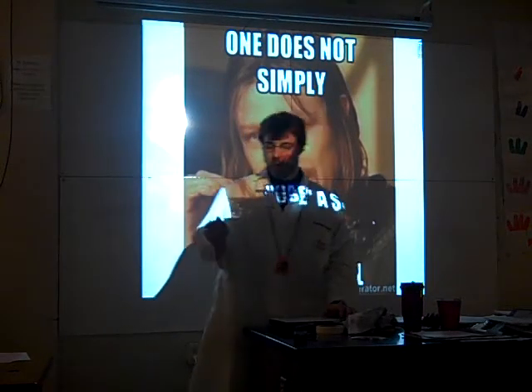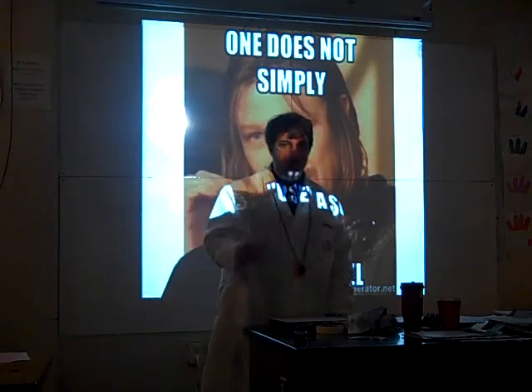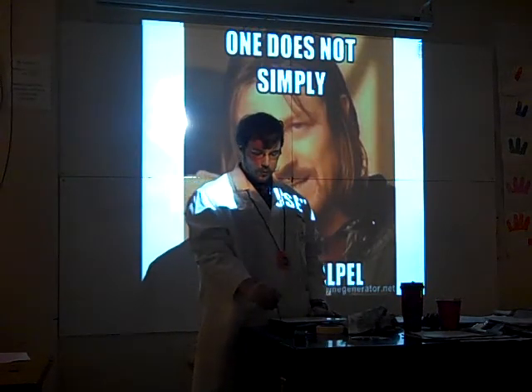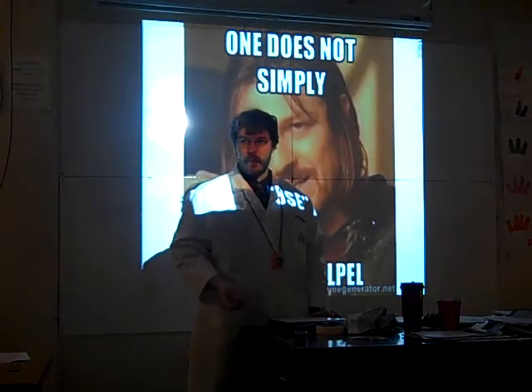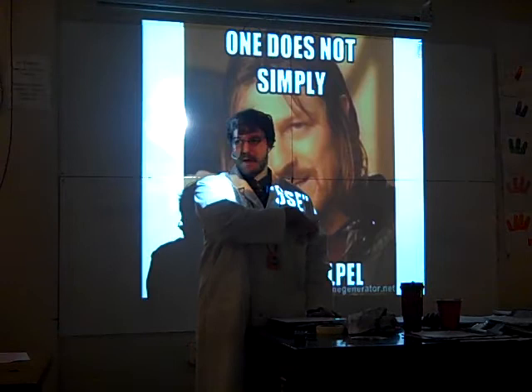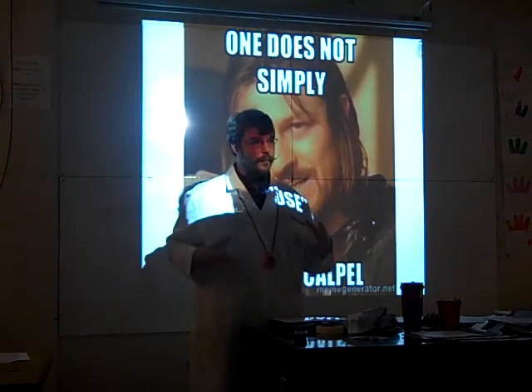So be really careful. When you're not using it, don't use it to point at stuff. That's what the probe's for. See this with the probe end? All right, point stuff with your probe. Don't point at anything with the scalpel. When you're not using the scalpel, it should be down with the blade facing towards the metal side of your tray. That being said, they're really fragile because they're so thin.